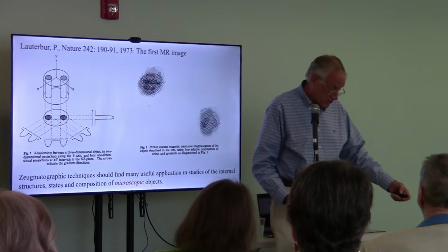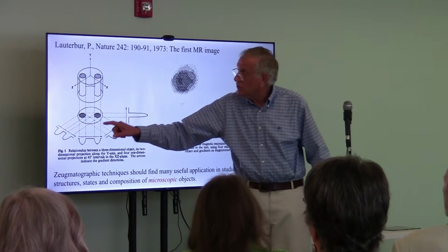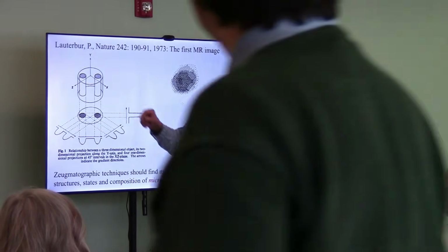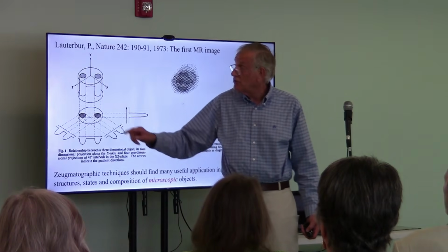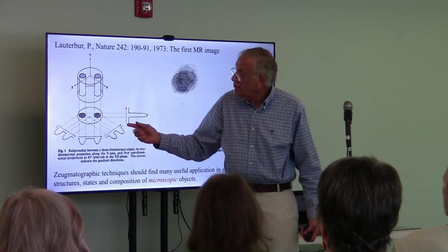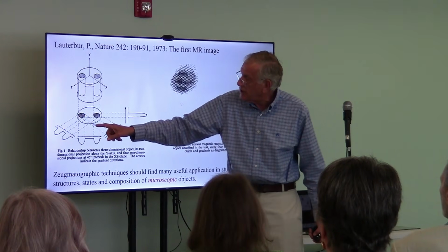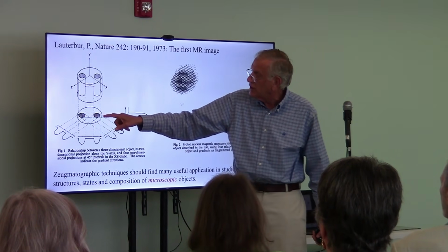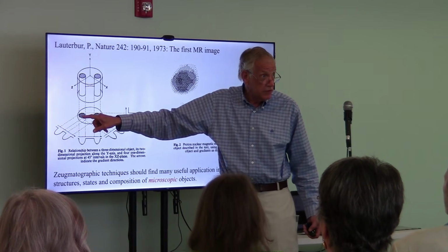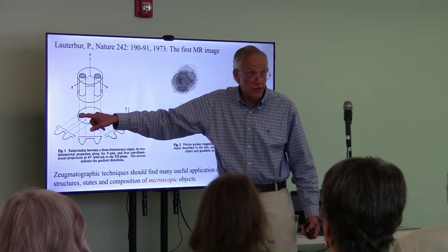And there was a strip of paper that had one of these traces. What he did, he had a magnet like was used by chemists. Paul was a chemist, and he put 2 capillaries in there. And he changed the magnetic field so that as you went from here to here, as you go across, the magnetic field changed. The direction remained the same, but its strength changed.